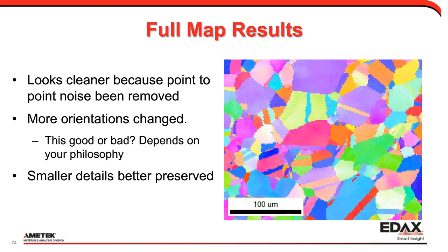Now, here is basically if I ran the whole thing through it. Here's the full map, so I didn't actually partition anything.